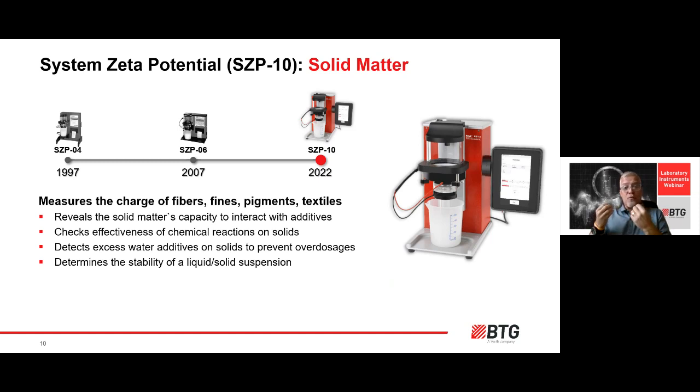And that was a really interesting way to understand the process. If chemicals ended up in the water, that's a scary thing. But we also want to be able to tell if they're getting onto the fiber. Are they using up some of that footprint of the fiber charge that's available? This device allows us to do that. It can tell us, are changes being seen from an additive being put in the system relative to the fiber?